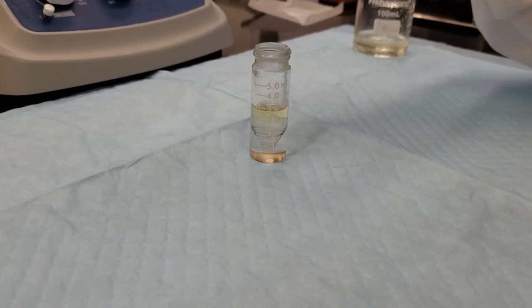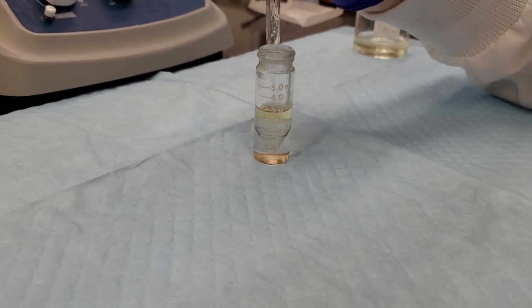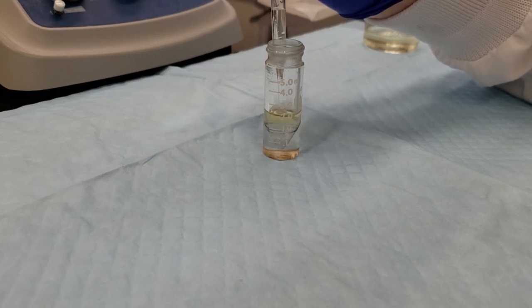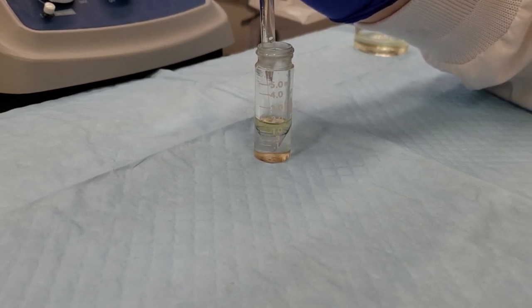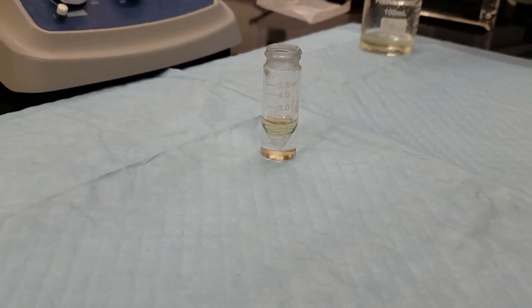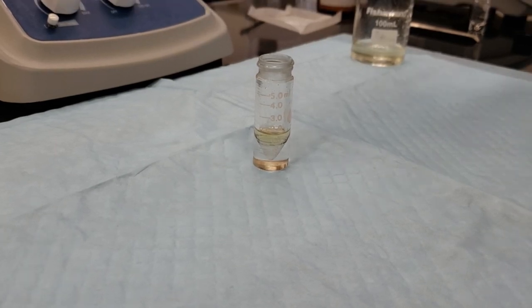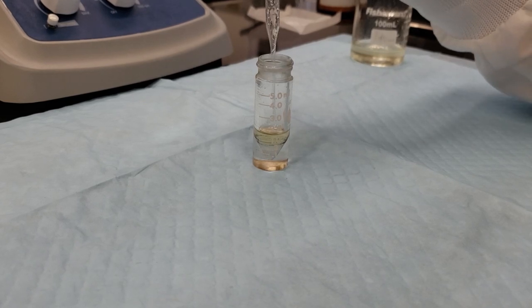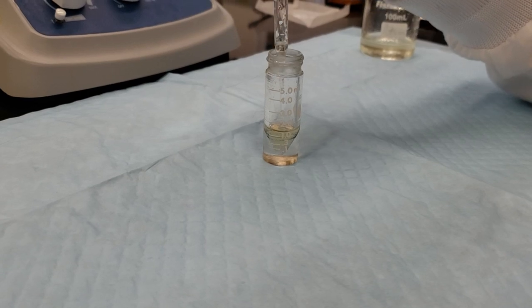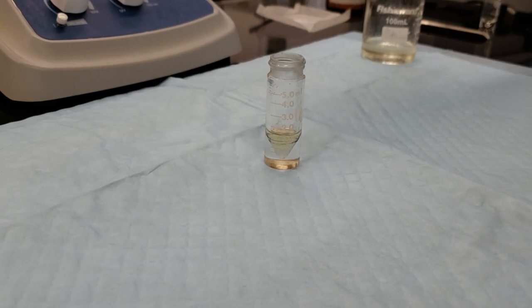Using the same technique that we did before, pushing my pipette bulb down completely, going all the way down to the bottom, and just drawing up the aqueous layer. If something goes wrong, the beauty of this is that we can just pipette everything back into the flask and do the separation all over again, but we certainly hope that that won't happen. Pretty close to the end there. Just have to be very careful.